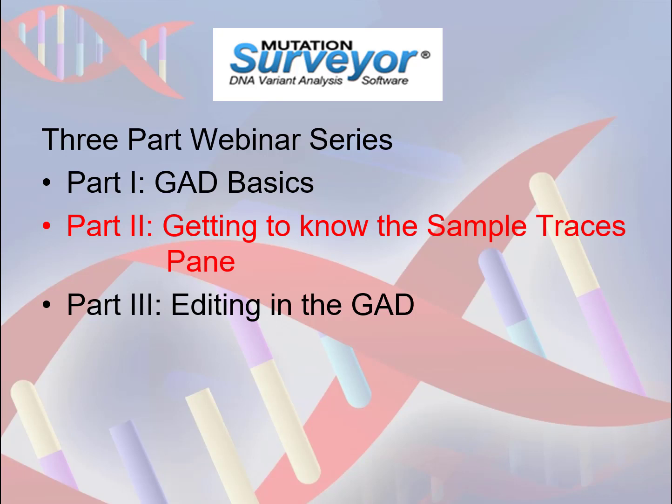To learn how to use the Sample Traces pane, along with the Mutation Table pane, to add and edit variant calls for a sample within your project, please view Part 3 of this webinar series.